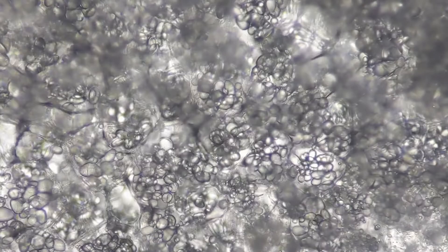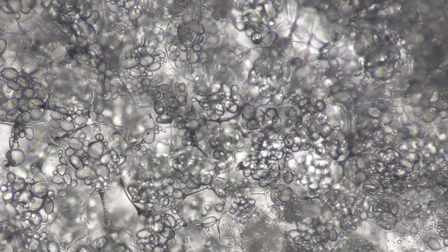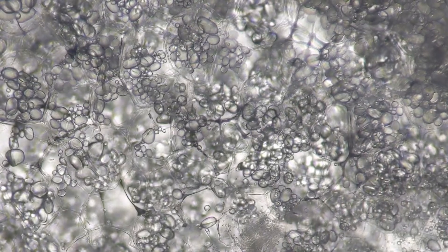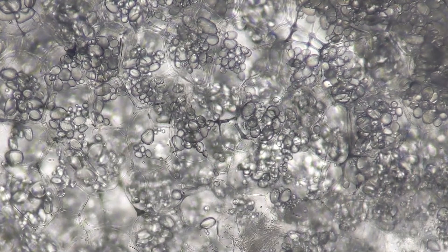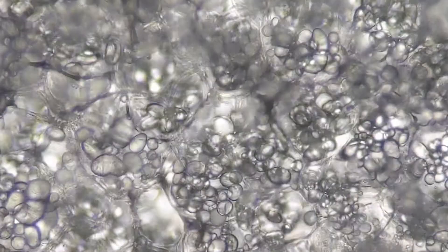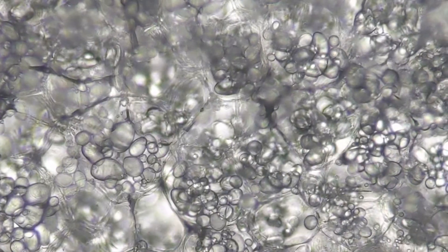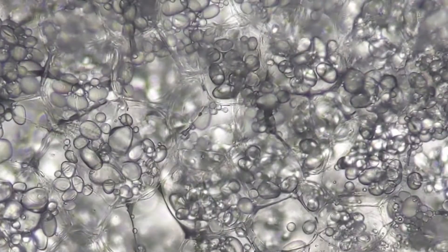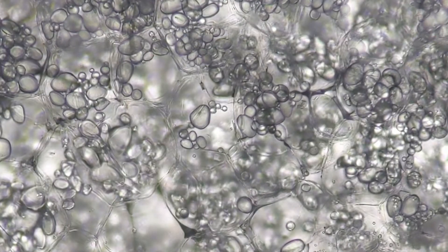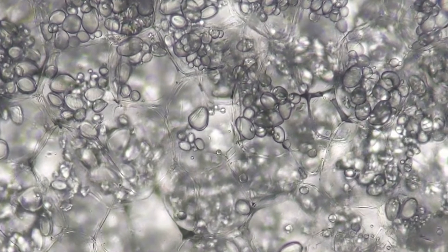The first time you look at a potato slide it can be a little confusing, but a little coarse focus work moving through the depths of cells starts to reveal this honeycomb of cells. Those little granules are not cells — those are organelles, those are leukoplasts. So if you can see the honeycomb cell walls and then the leukoplasts within, it starts to make sense. It's kind of like a bunch of glass jars carrying clear jelly beans — that's the nature of potato cells.